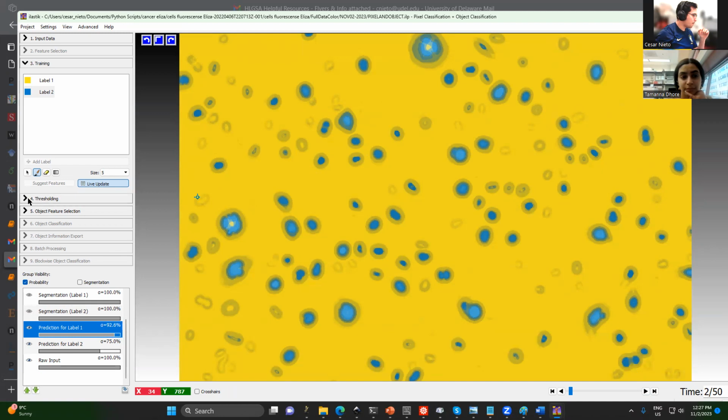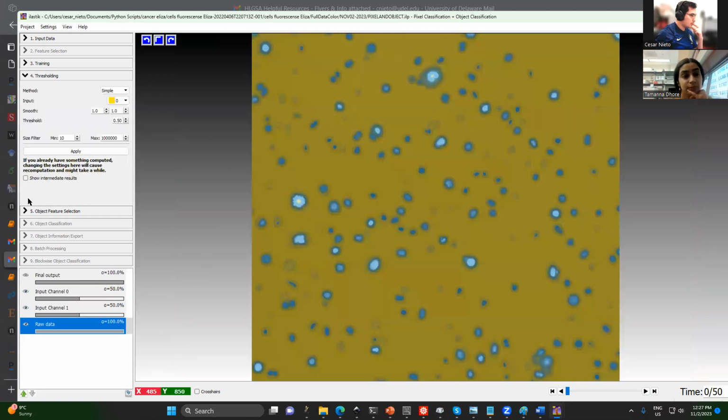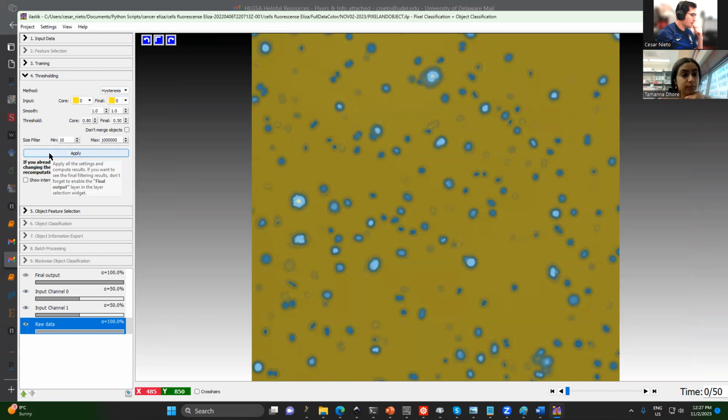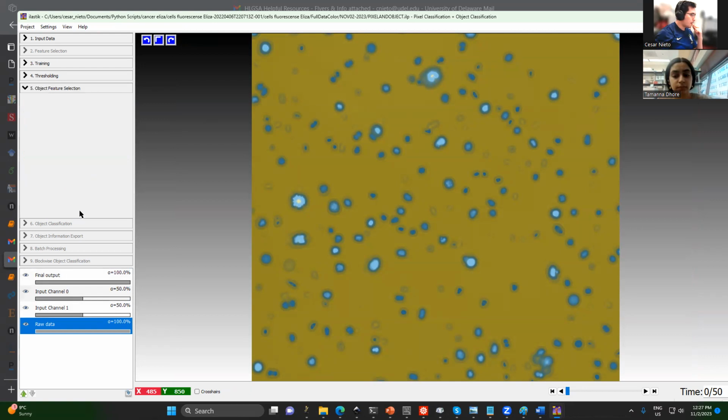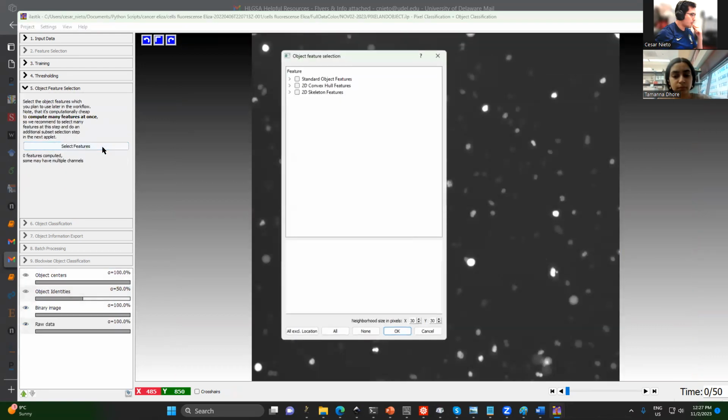And okay, this threshold, I think. I don't understand this very well. So this is like art to me. I check and okay. So here, object the same.